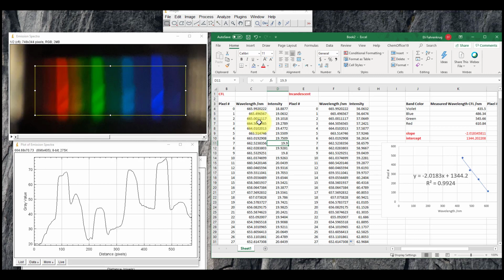And that's what you're going to do in the next lab going forward when you quantify the concentration of dyes in some M&M candies. But this is the general calibration protocol and the image processing routine to convert the pixel number of your phone into an intensity. So you have all the tools. This is what you'd need to do every time you process an image.